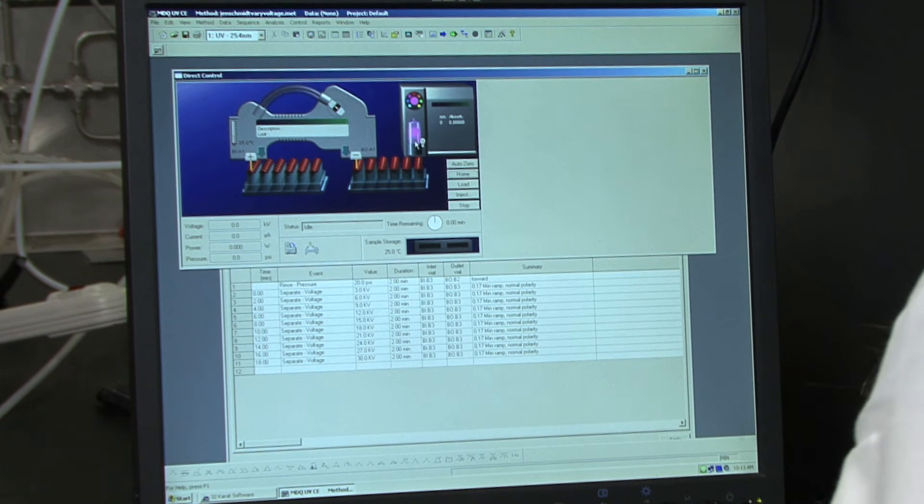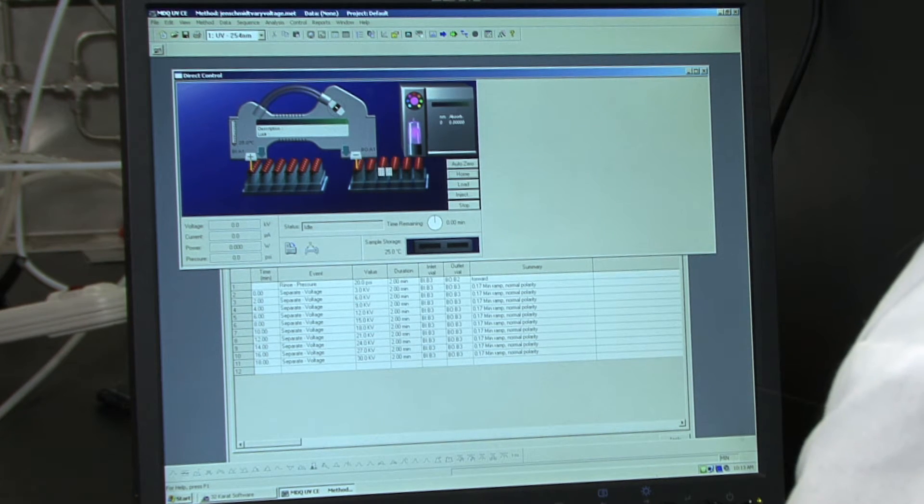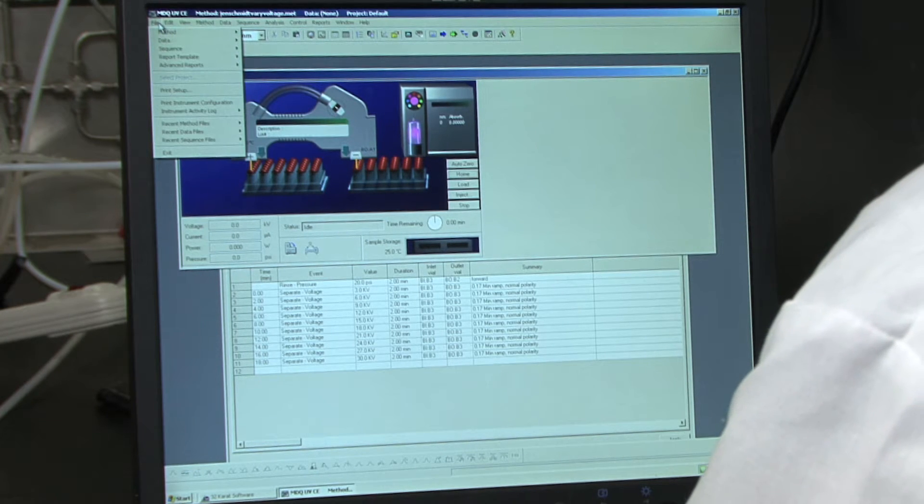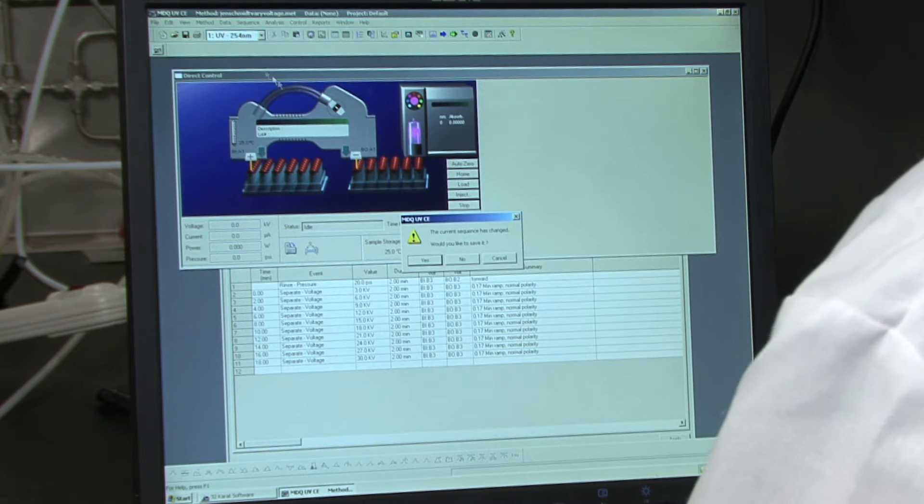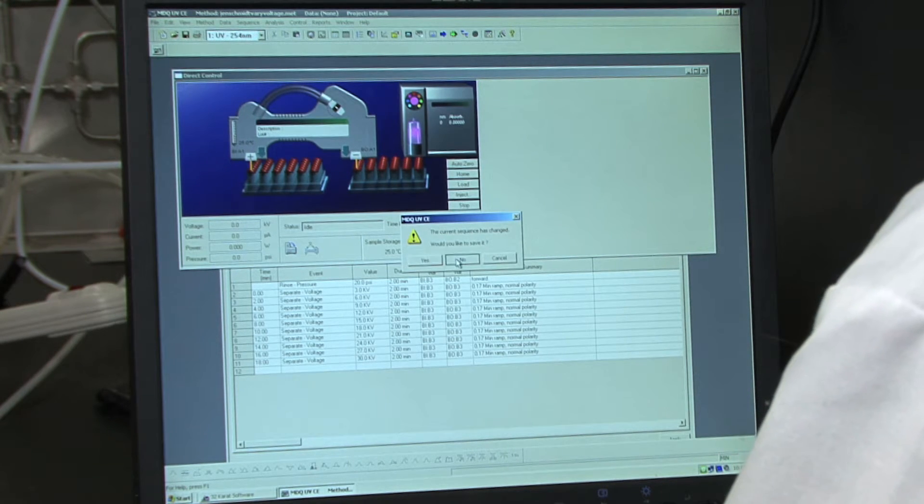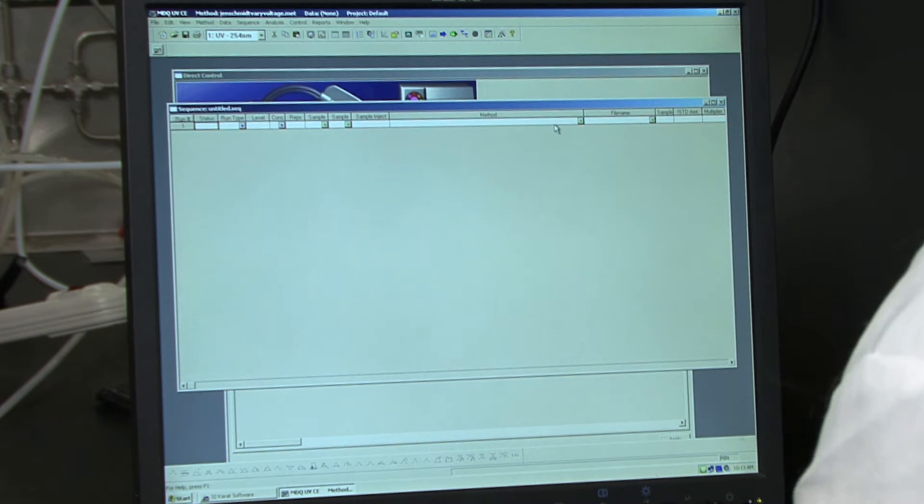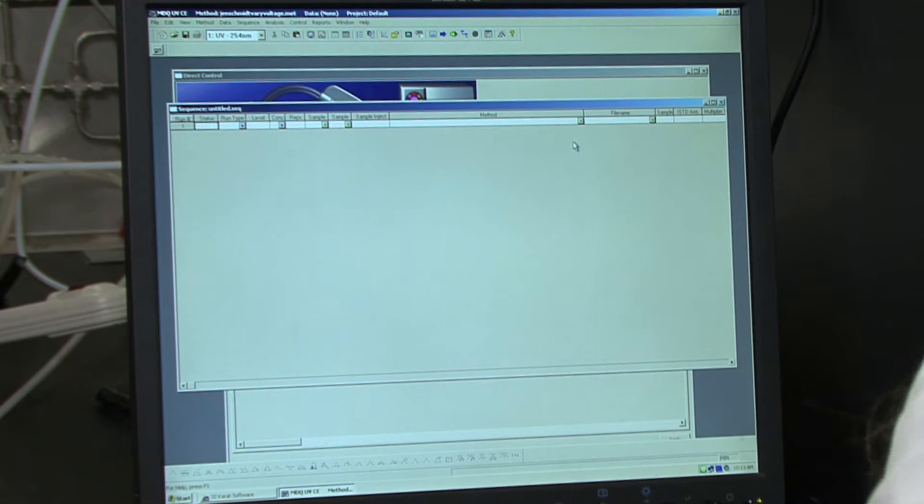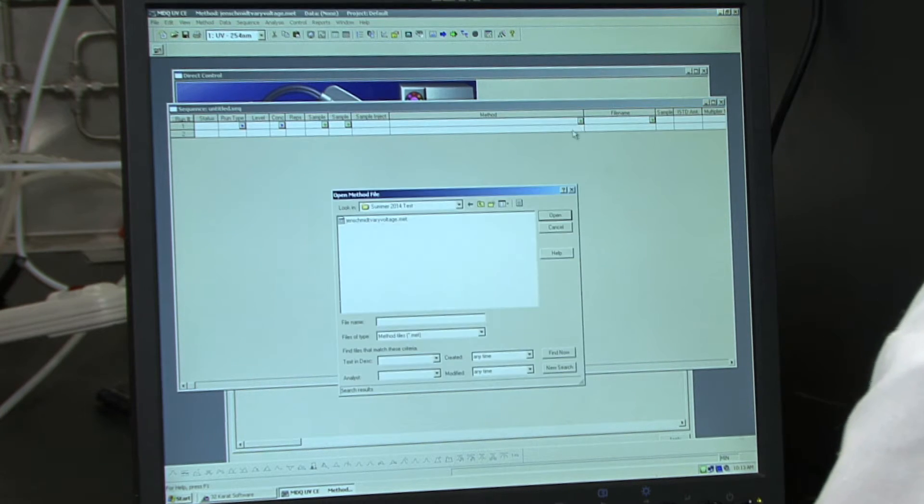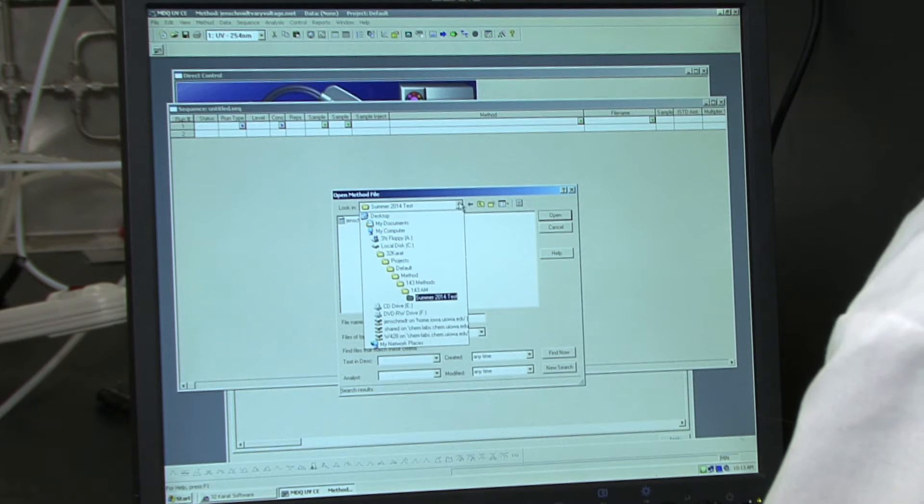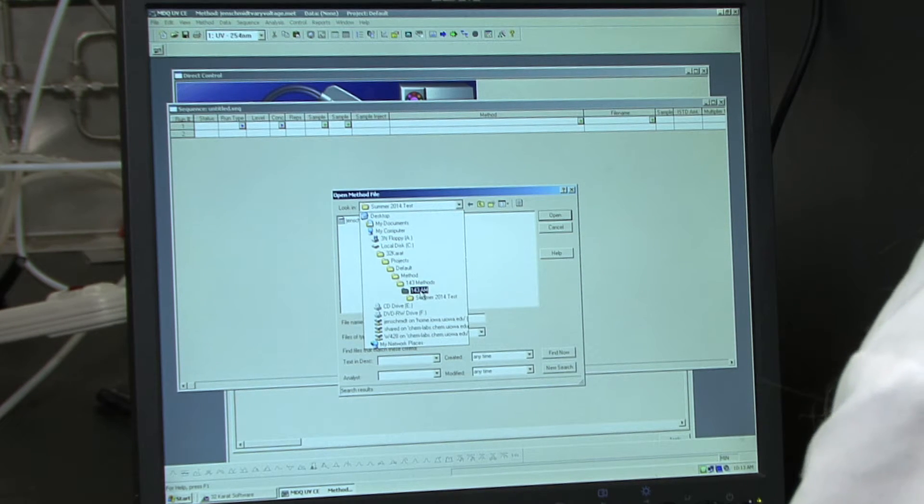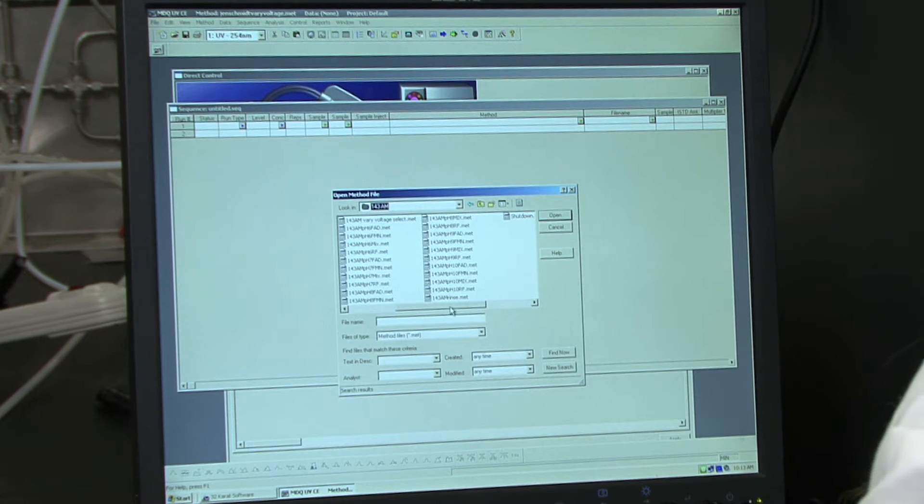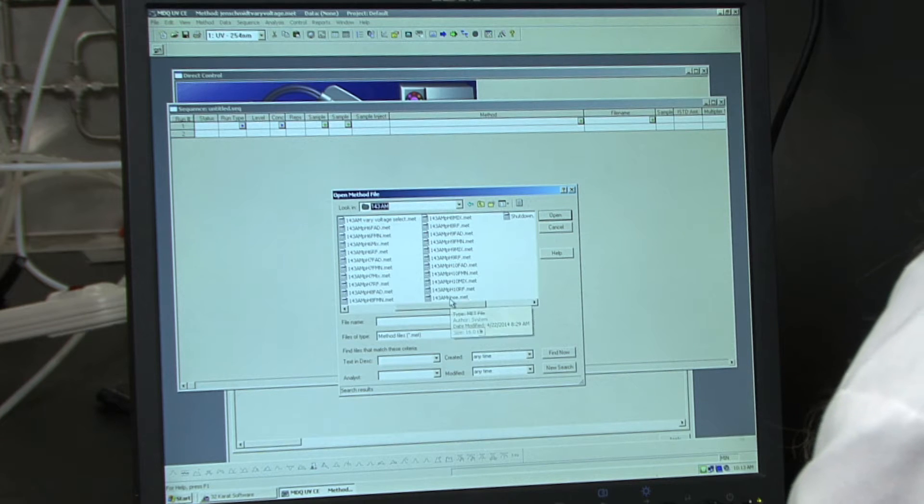So when the UV bulb is warming up, you can create your first sequence. To do that, go to file, sequence, new. Now the first method that you want to load is the rinse method. So to load the method, you click on this green diamond in the method cell. And scroll back up to the 143 AM methods. And you want to click on the 143 AM rinse method.